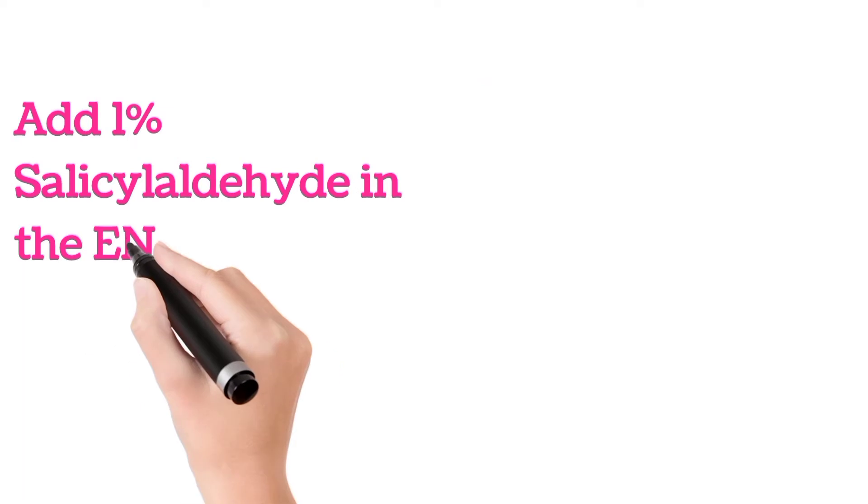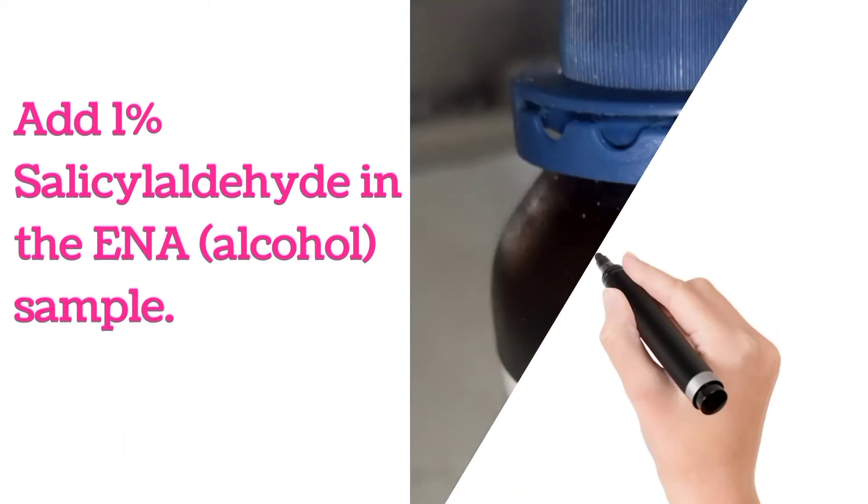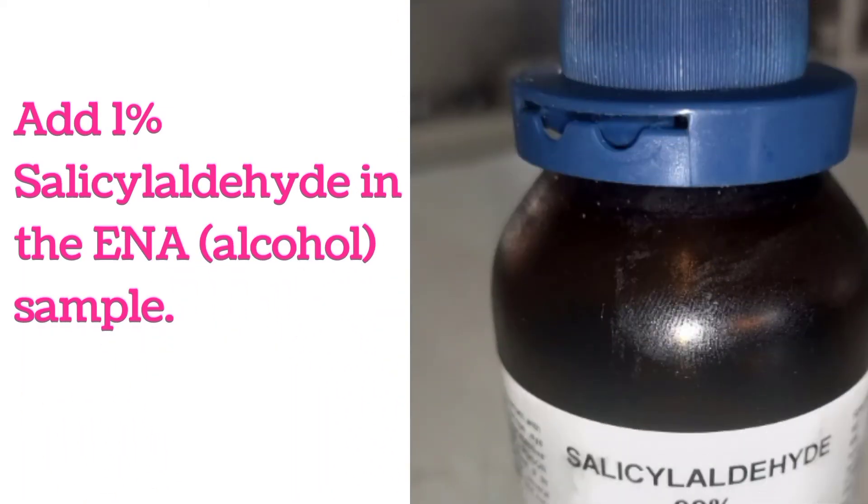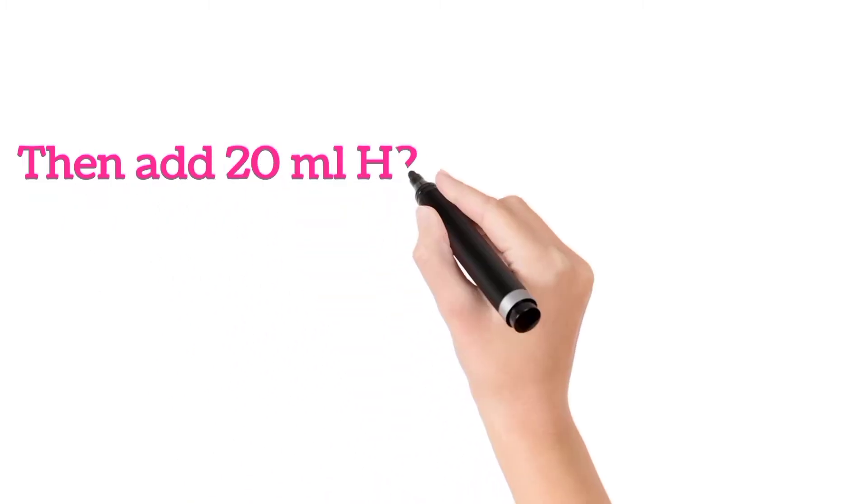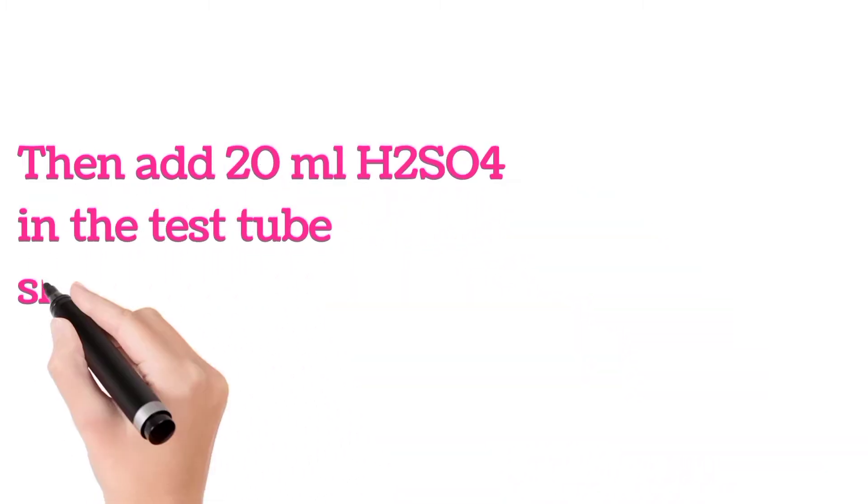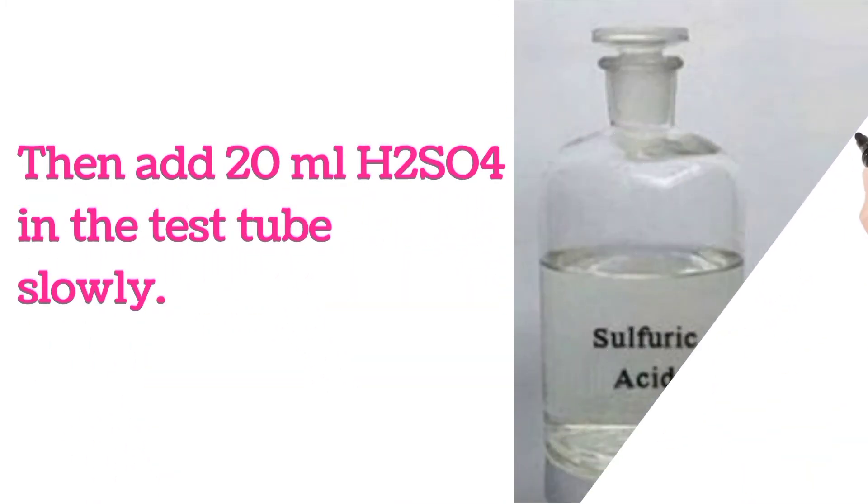Add 1% salicyl aldehyde in the ENA alcohol sample. Then add 20 ml H2SO4 in the test tube slowly.